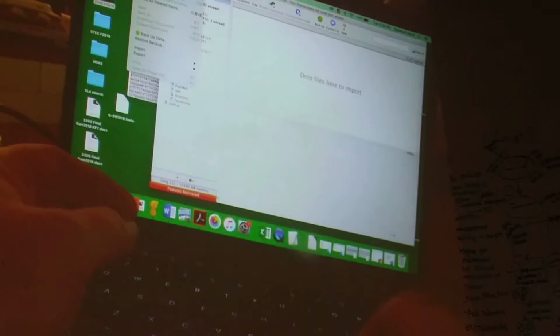Under the local or under it? You're copying the whole tree background file. And then it'll probably open up like that, and you just copy them.